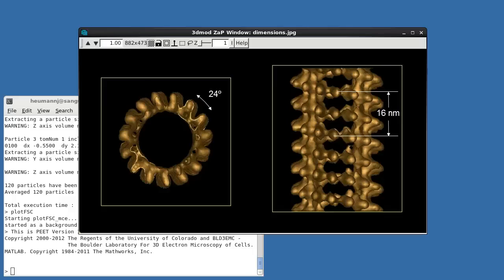15-protofilament microtubules are helical, and we expect each of the 15 spikes making up one helical turn to be identical. We can use this symmetry to improve our averages.